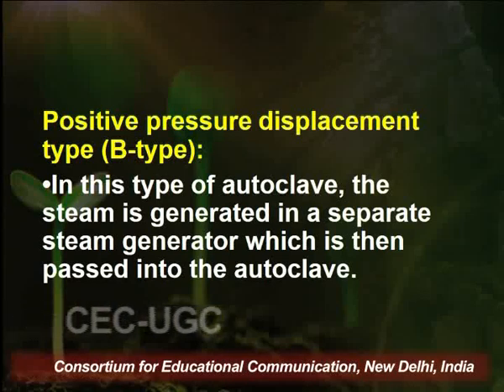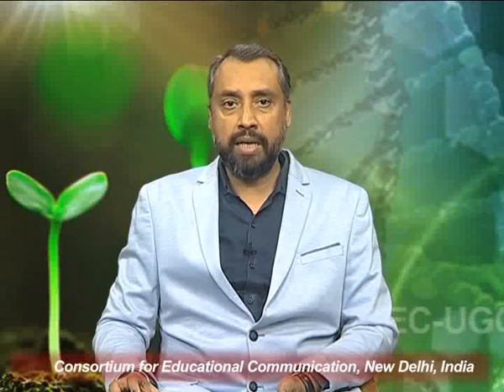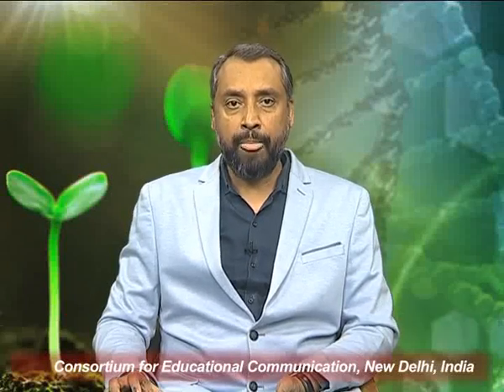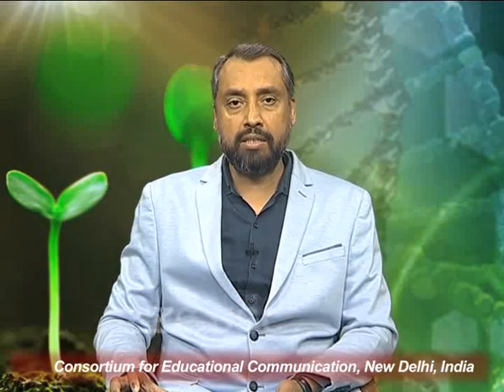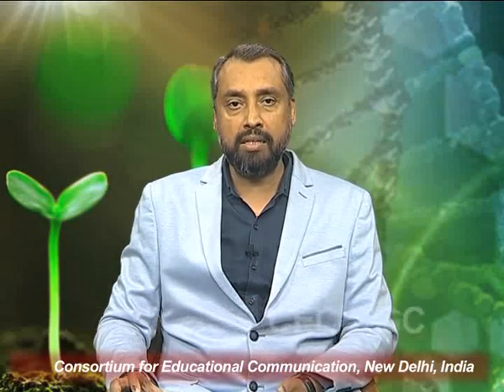Then the other type of autoclave happens to be the positive pressure displacement type. In this type of autoclave, the steam is generated in a separate steam generator, which is then passed into the autoclave. This autoclave is faster as the steam can be generated within seconds. This type of autoclave is an improvement over the gravity displacement type.